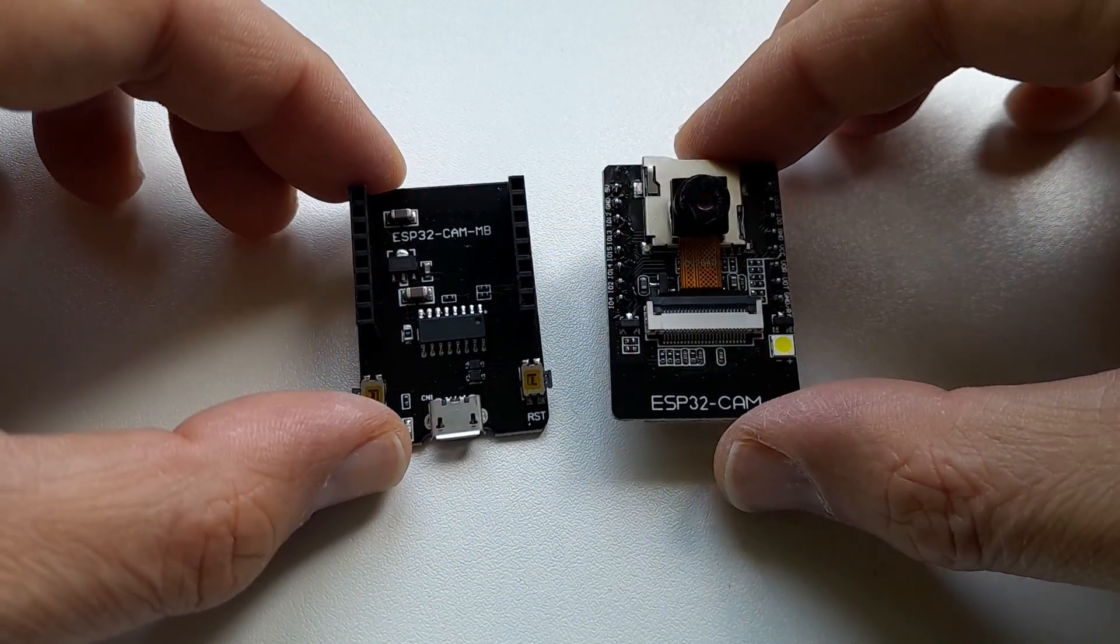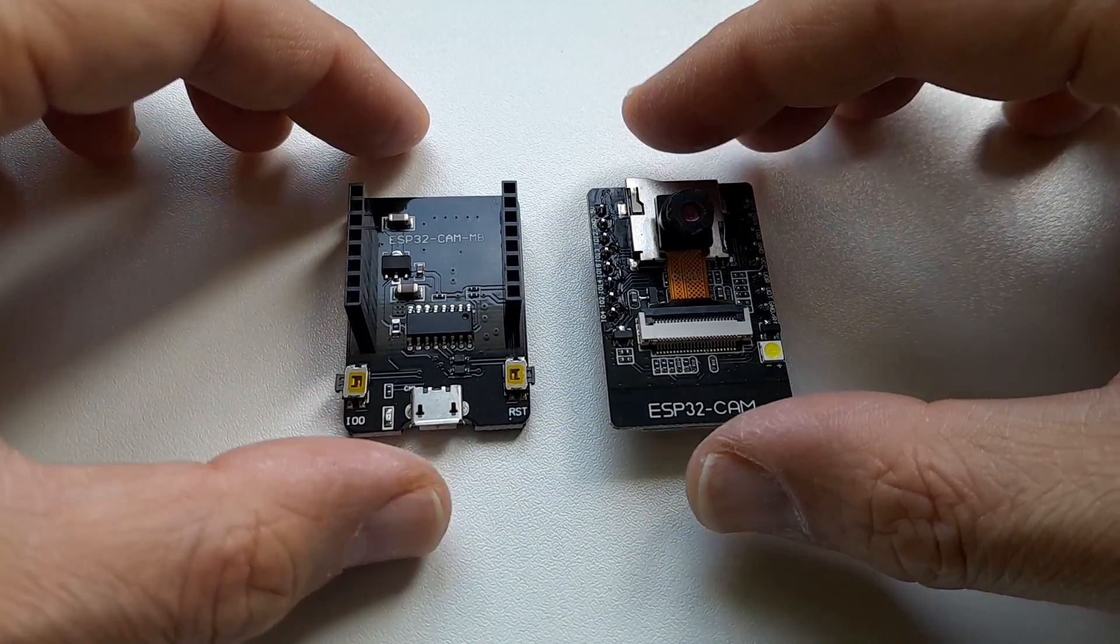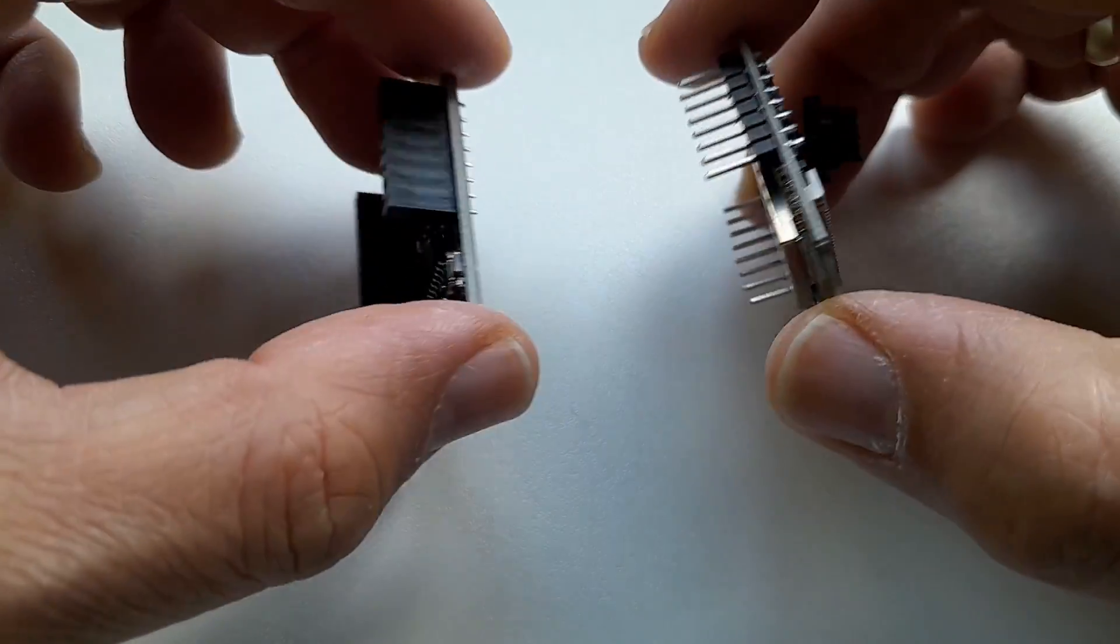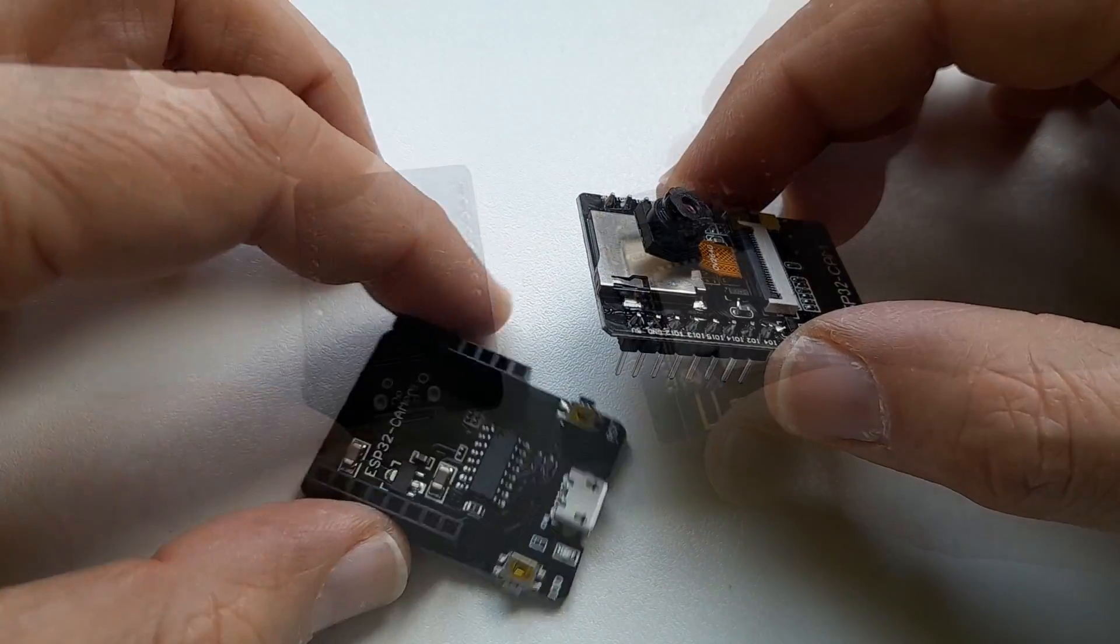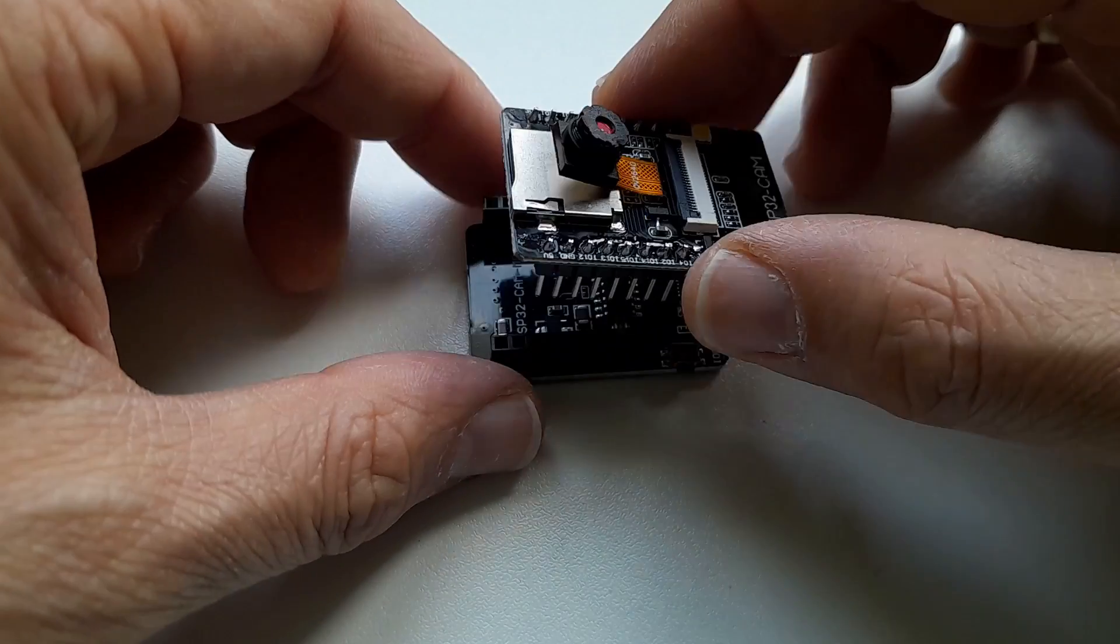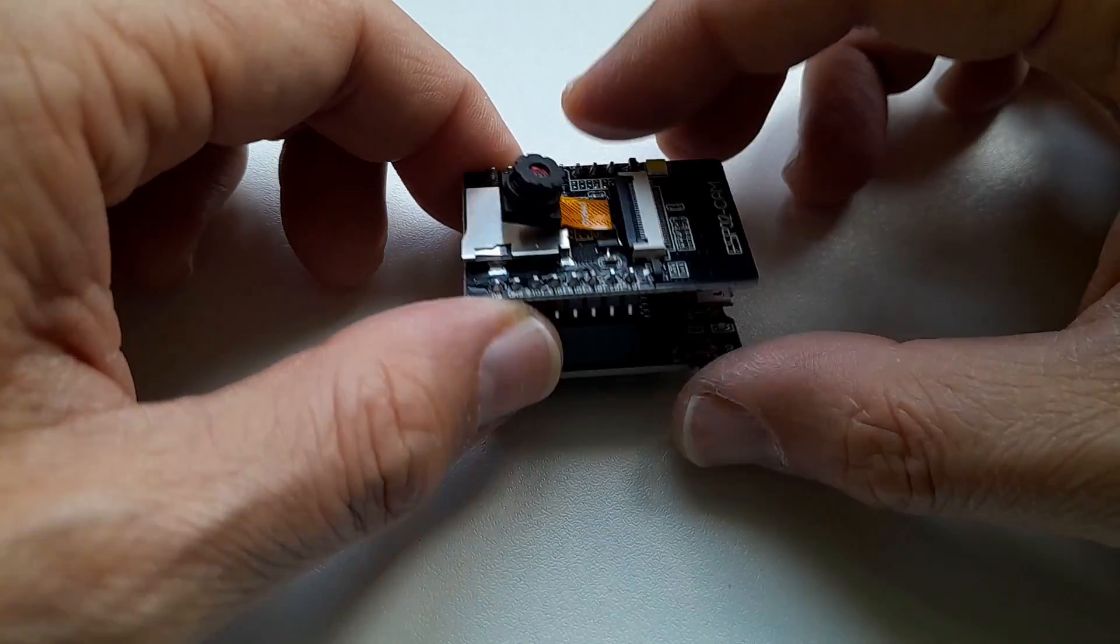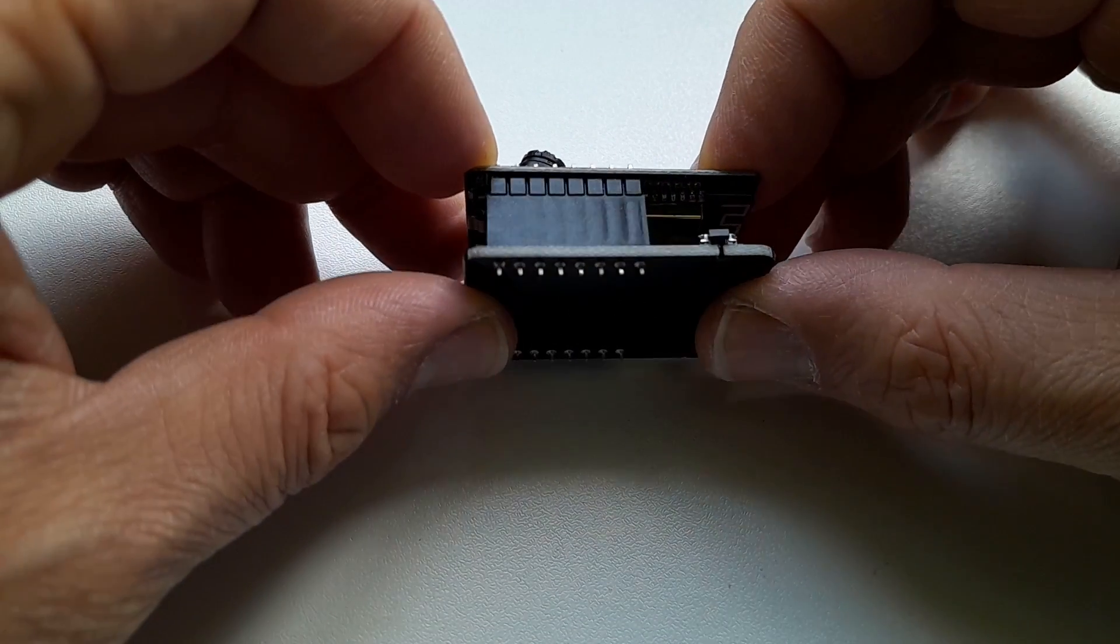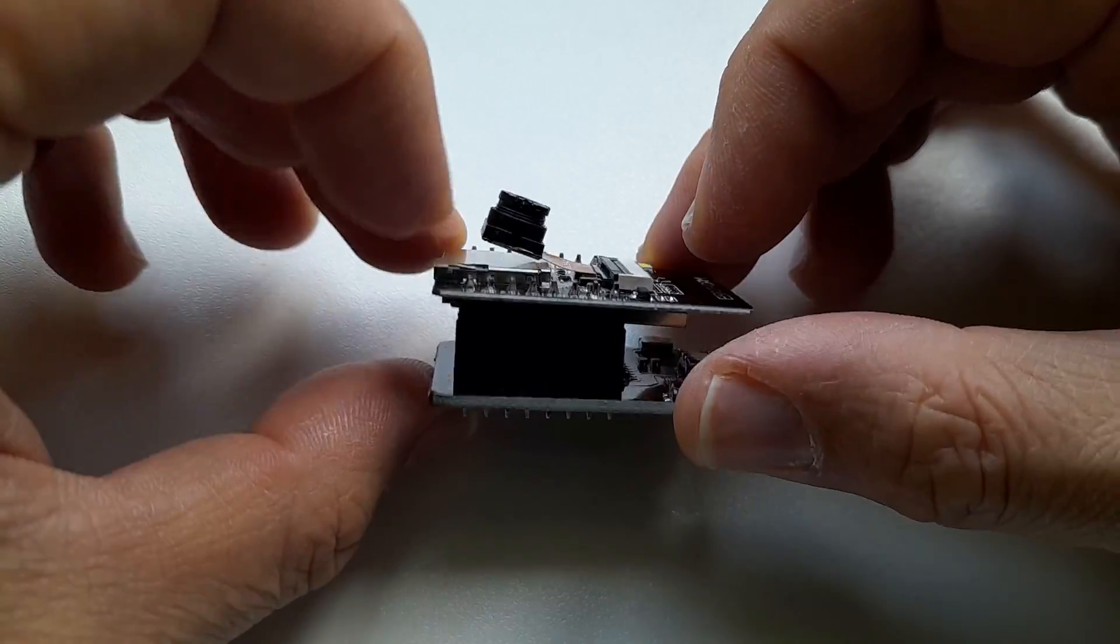This is the heart of the whole system. It is the ESP32 cam module and also a USB programming board. It has to be put together first and yeah there was a kit by the way and I'm now going to assemble the kit.